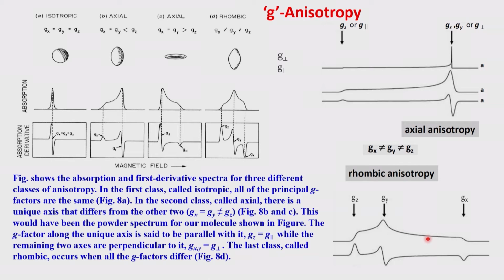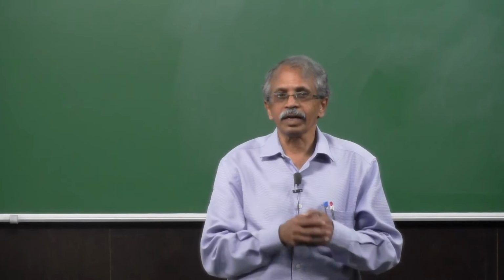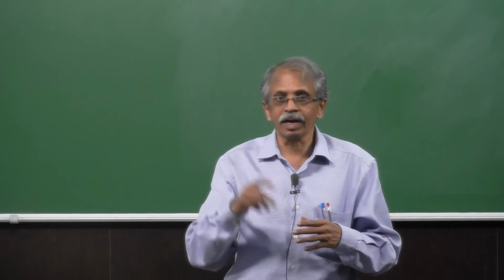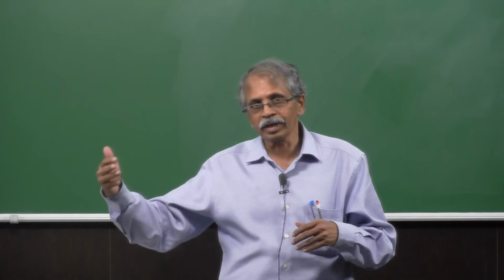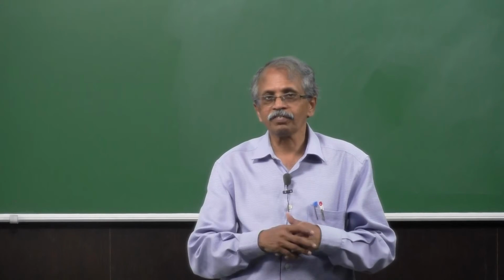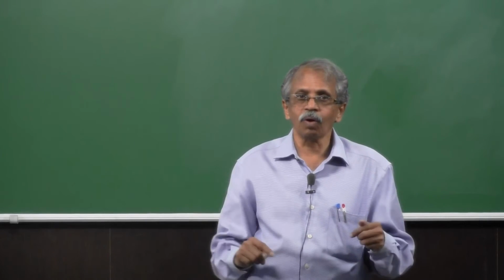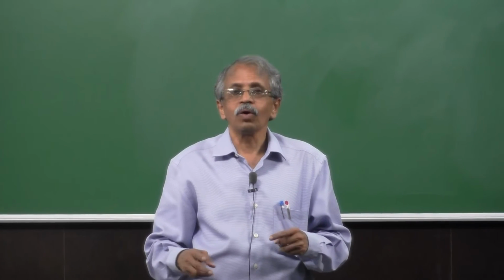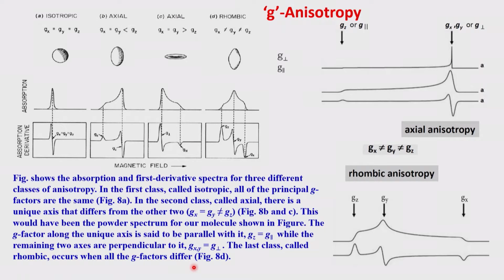Now we have got an additional parameter in the EPR spectral domain, called the anisotropy. You already have electron nuclear spin coupling, hyperfine coupling, electron with other nearby nuclei, super hyperfine coupling, and then electron coupling, which is a weak one. If it is weakly coupled, then you will get ferromagnetic or antiferromagnetic behaviour, or if they are strongly coupled, you will get a zero field splitting kind of thing. And now on that, this anisotropy gets overlaid.